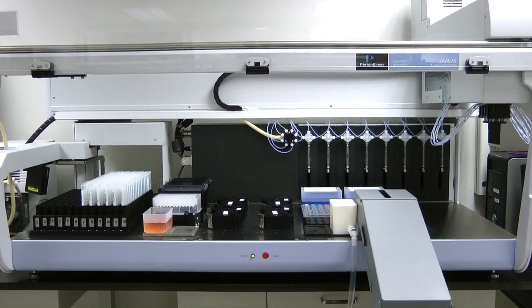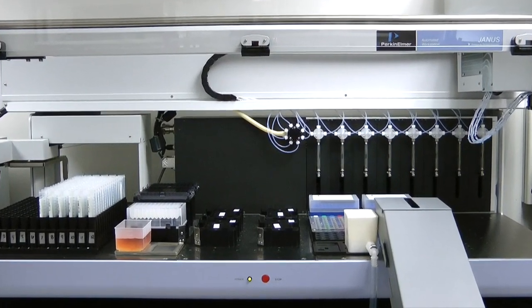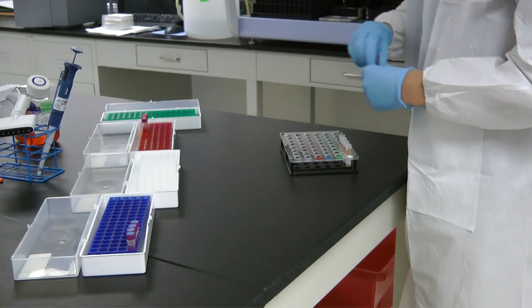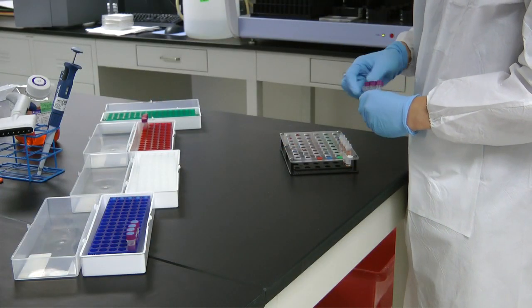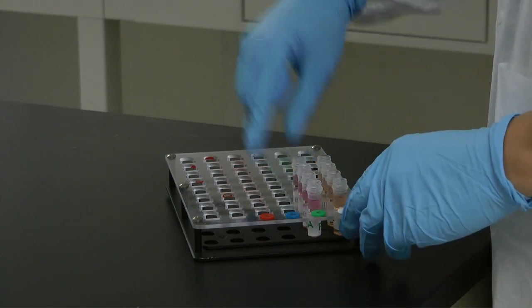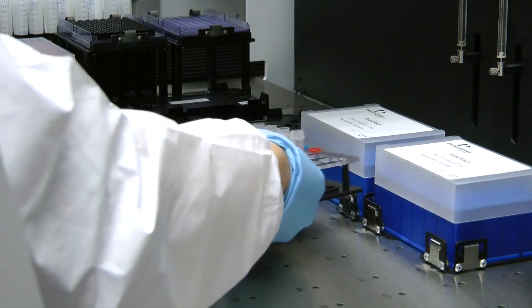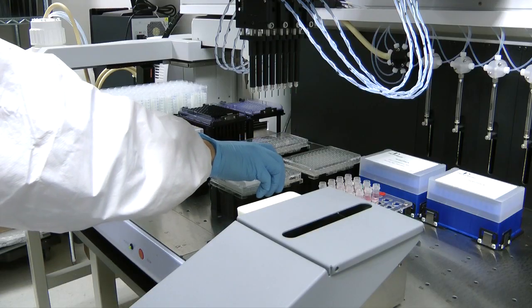Cell plating and reagent addition is also made quick and easy with the Janus liquid handling system. Several vials of reagents including AIM-5 cell media, panel A, panel B, and PHA, and four T-spot TB plates labeled with unique identifiers are loaded to specific positions on the Janus.